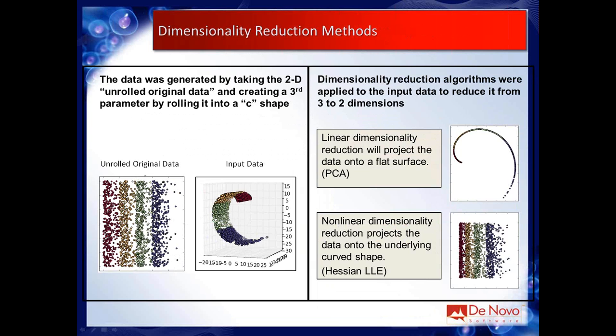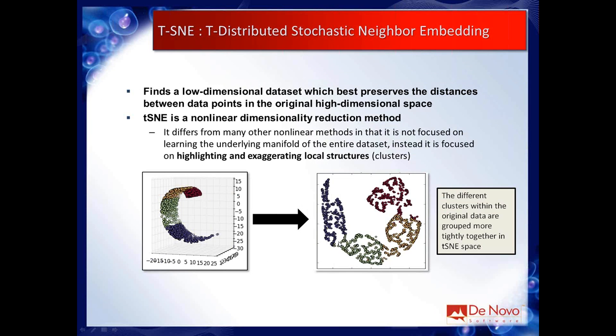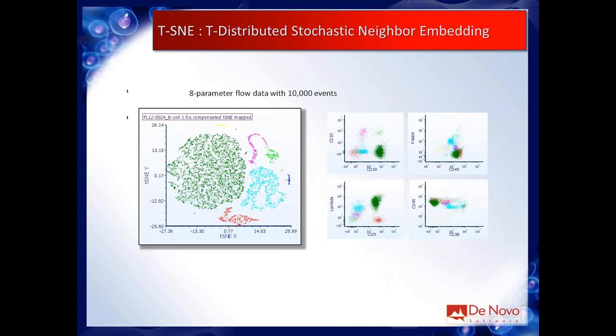And it takes these gaps in between the data and exaggerates those and pushes those farther away from each other. So what you see is these more tightly clustered groups. It's pushed these together into more circular shapes. And that's why it's useful for us.